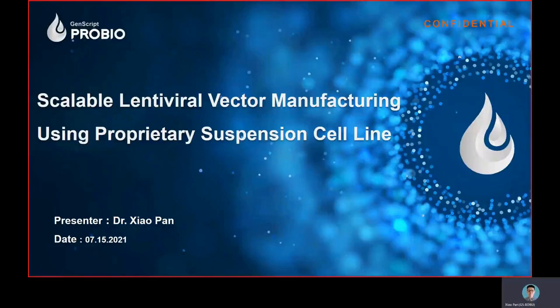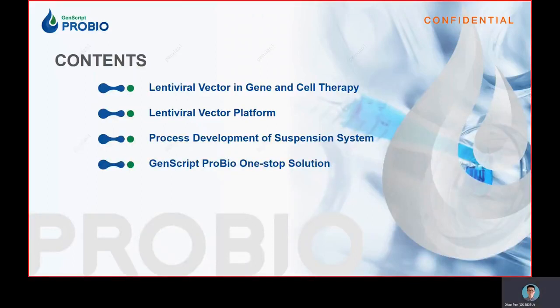This is Xiao Pan from GenScript Probio, focusing on process research and development. Today, I'll talk about scalable lentiviral vector manufacturing using proprietary suspension cell line. I'll talk about the following parts. First, I will give you some background on lentiviral vector in the application of gene and cell therapy.